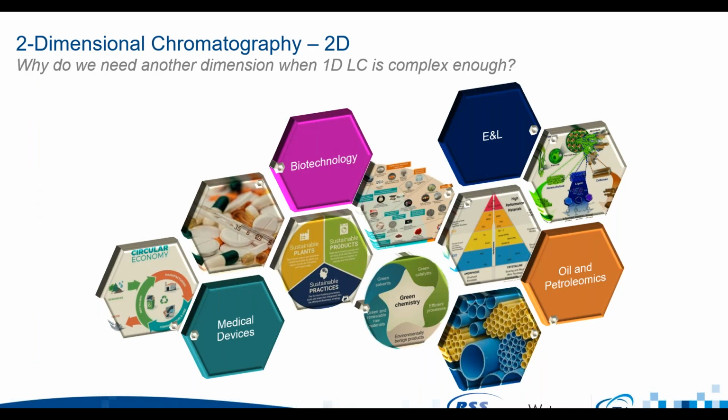So separation technology in general, you may have heard of GPC, gel permeation chromatography, or sometimes it's called SEC, size exclusion chromatography. In general, for those of you who don't know, it is the separation of polymers similar to LC or HPLC, which you may have used for small molecule analysis, but based on the hydrodynamic size, so the general size of the polymer.